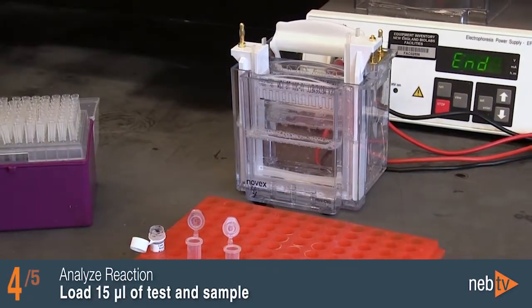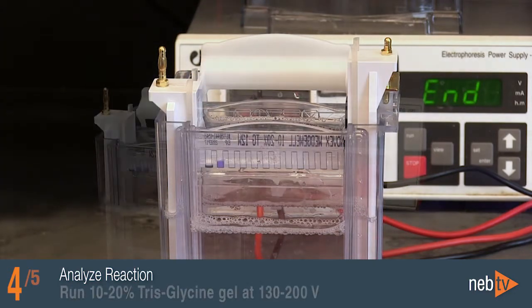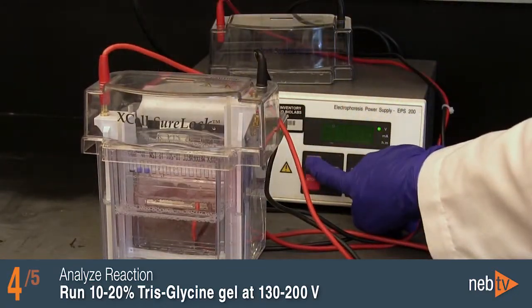Load 15 microliters each of the test sample and negative control side-by-side, and 3 microliters of the color pre-stained protein standard on a 10-20% tris-glycine gel. Run the gel at 130 to 200 volts.